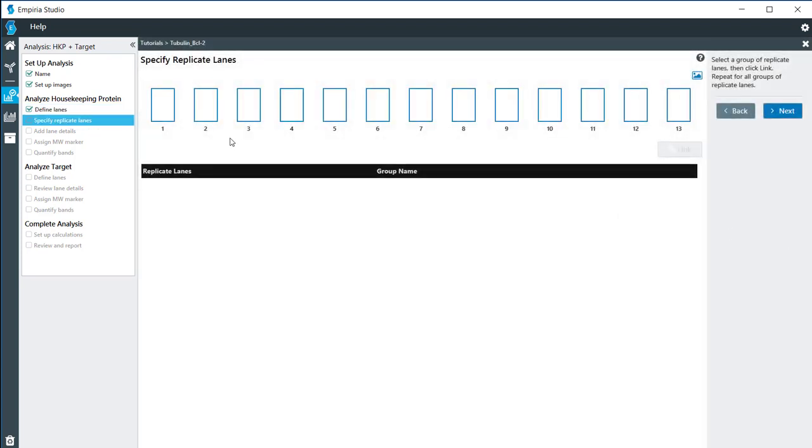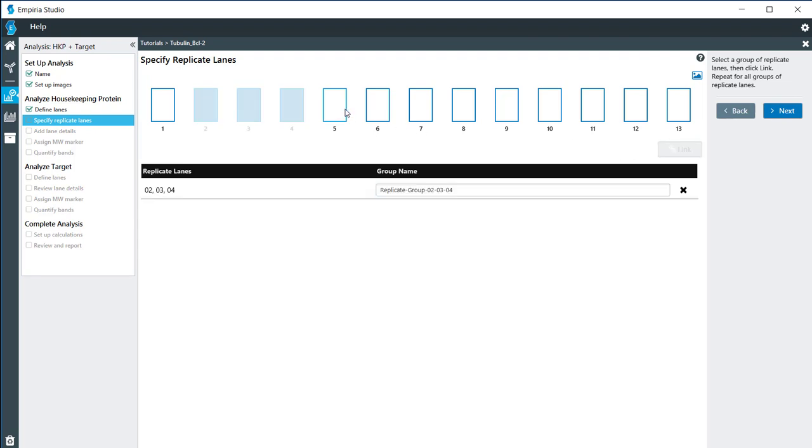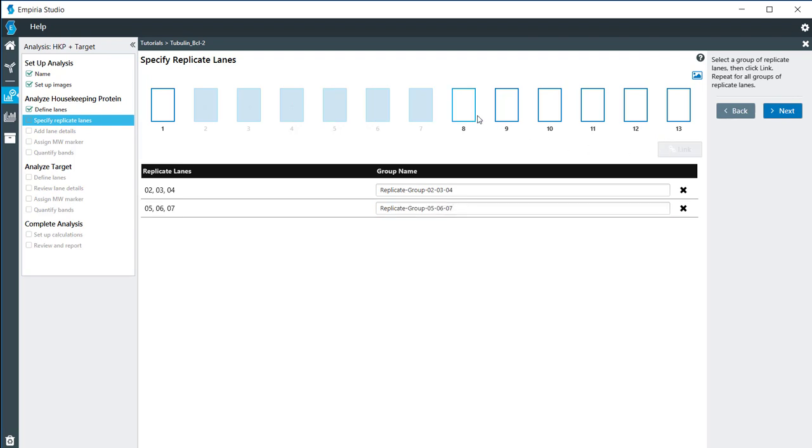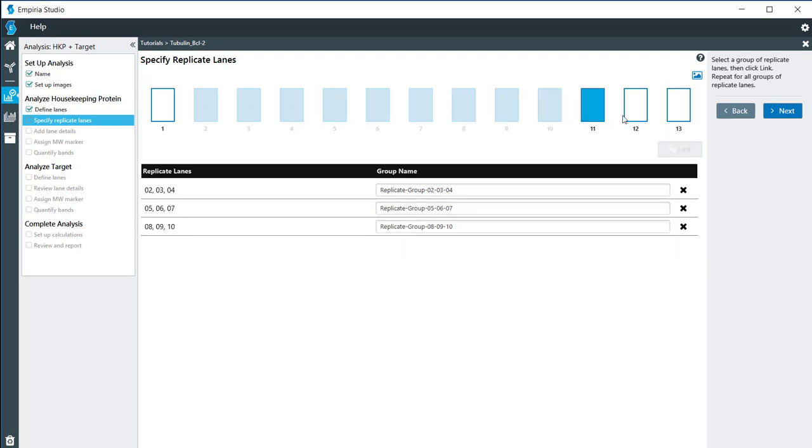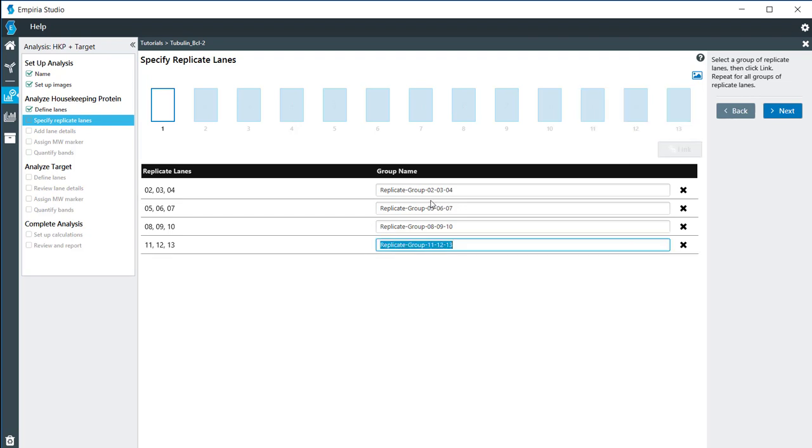Now I do have replicates on here. I have three lanes, each loaded with the same amount of protein and the same treatment. So I'm going to link those together, just like that. And these are jerkat cells.